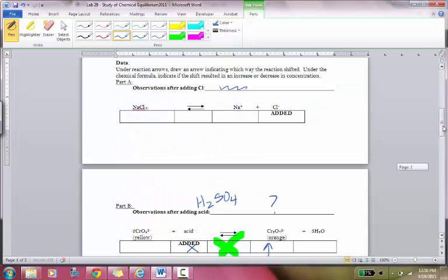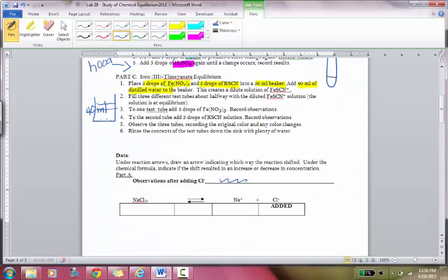When you're done with Part C, the chemicals for this part may in fact be dumped down the drain with lots of water, as the instructions suggest. So it's only part B that you have to worry about special disposal for.